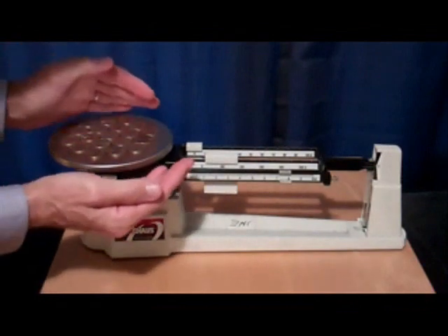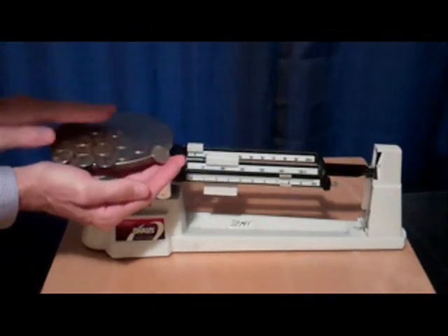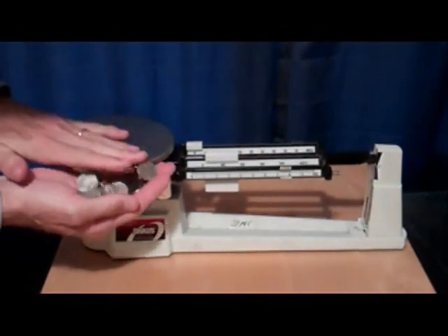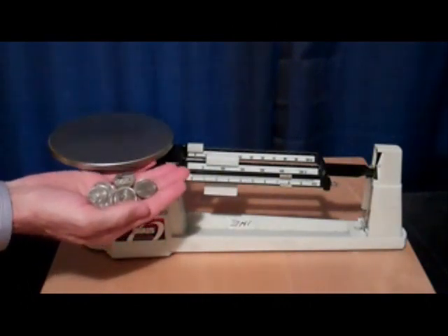The first step in preparing the triple beam balance for use is to clear off the pan. It pays to clear off the pan first.